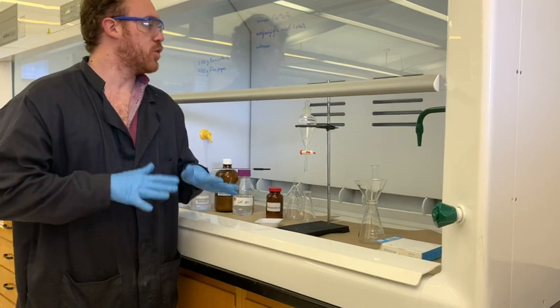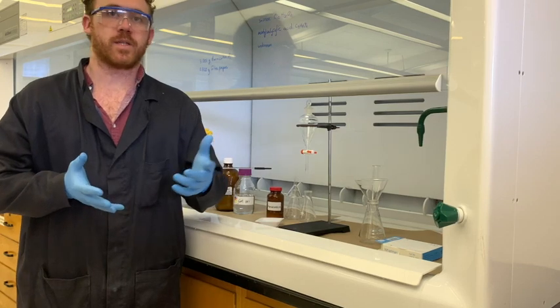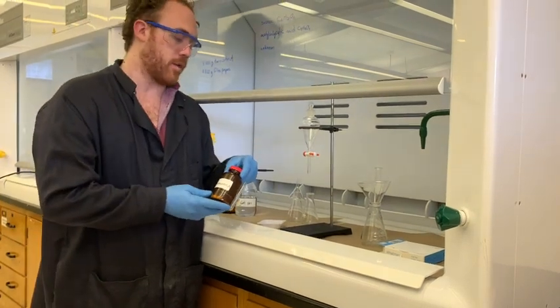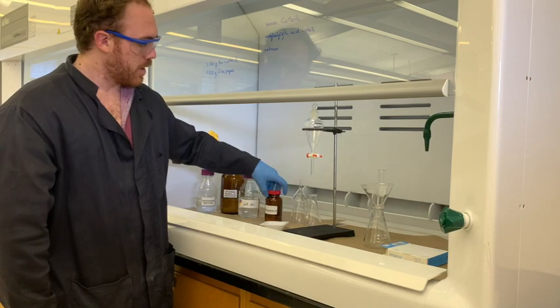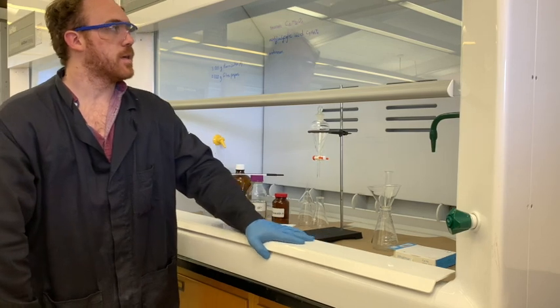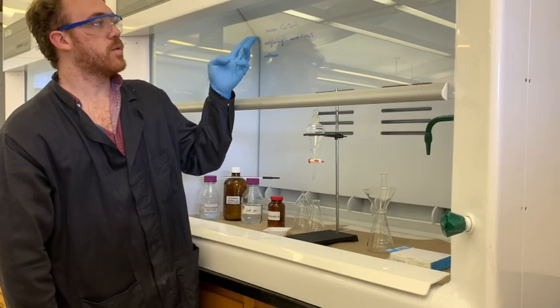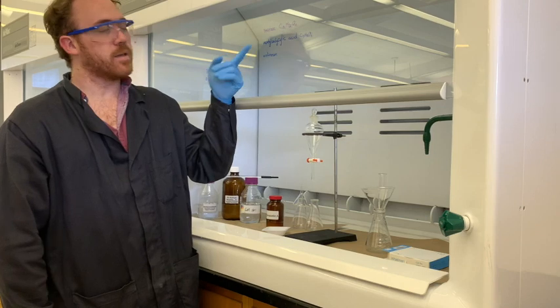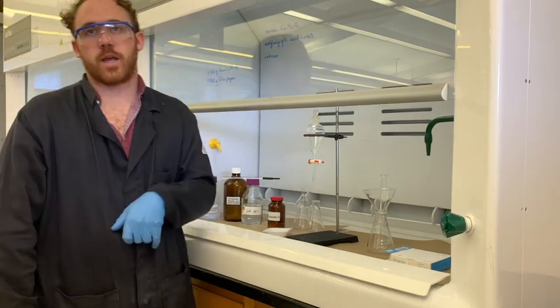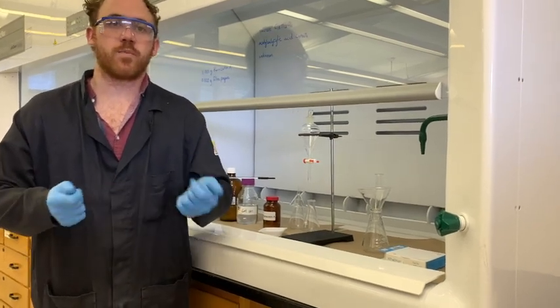Today we're going to be mixing together a mixture of compounds and trying to isolate each of them by using their different solubilities. In this mixture of compounds called Panacetan A — that's the one unknown we're using today — because certain compounds have different solubilities in different solvents, we're going to start by eliminating the easiest one, sucrose, then use acid-base chemistry to remove acetylsalicylic acid, and then isolate our unknown and find its melting point to identify it from a list of three possibilities.